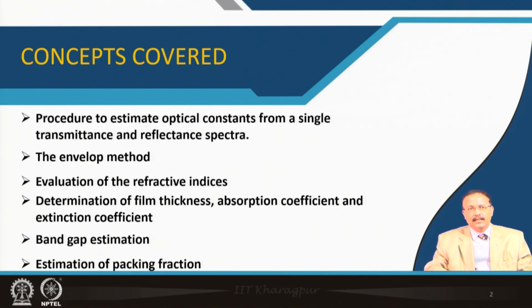The process that I will be describing today is known as the envelope method, and this is a bit empirical in nature, but you will find it useful to determine the refractive index of a transparent thin film as a function of lambda in the visible range.